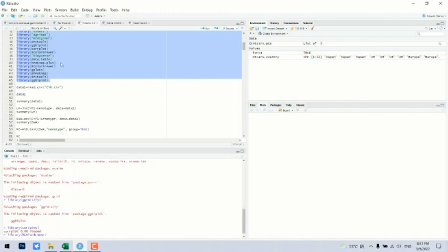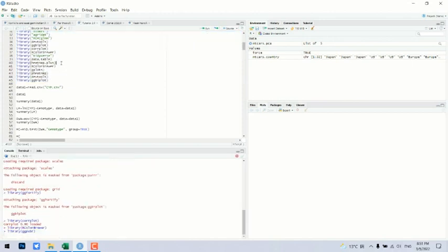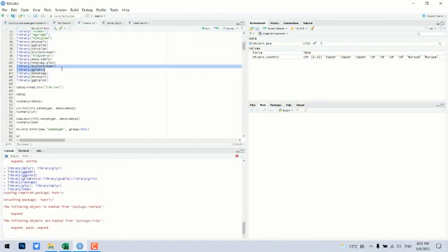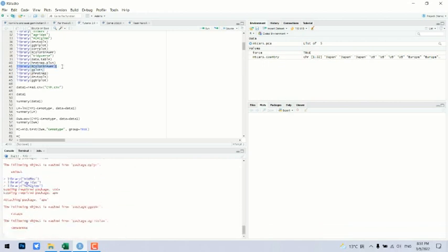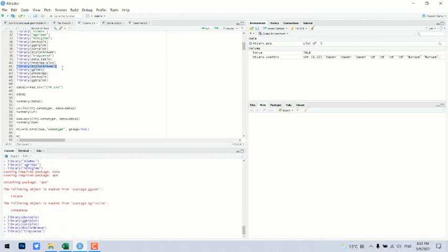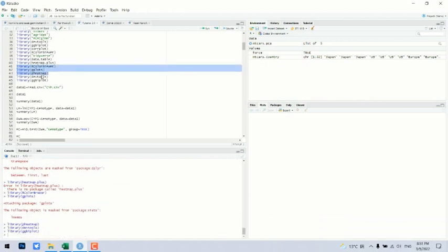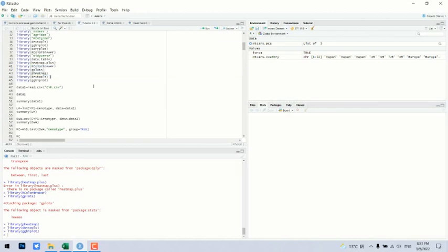For heatmap, we need a library: color river and p heatmap. These two packages are enough. So packages are opened. Now we can open our data.